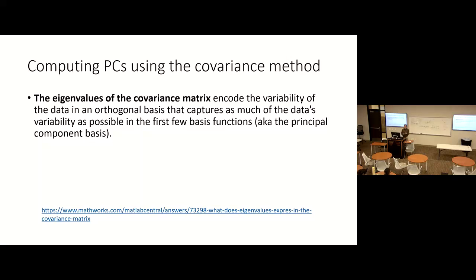Okay, so this is how the PCA will be officially computed through the standard procedure. We described what PCA is, what the purpose is, and compared it with the optimization method. But now this is how the real procedure in the built-in function is implemented.